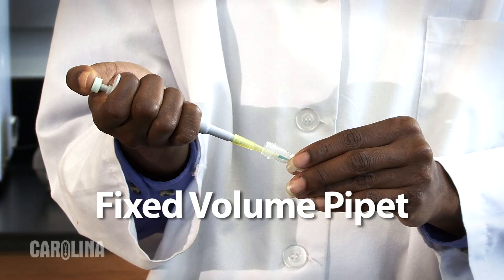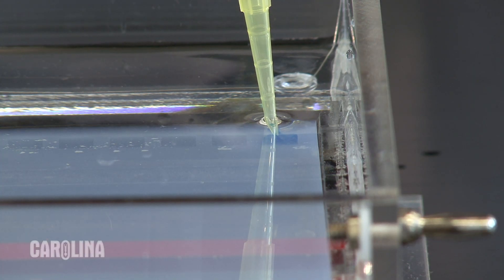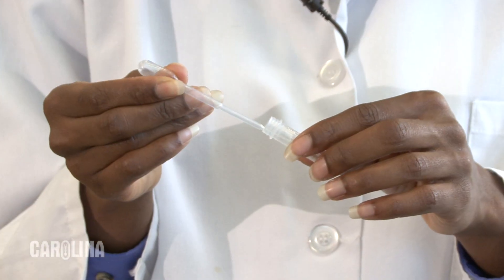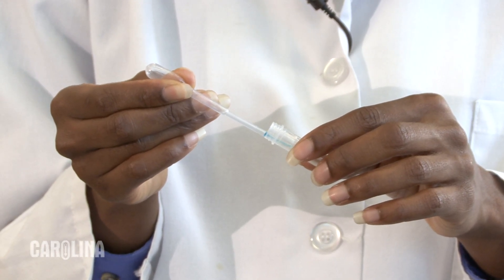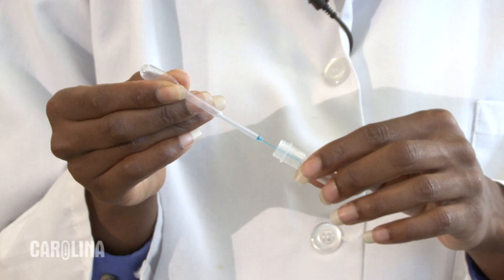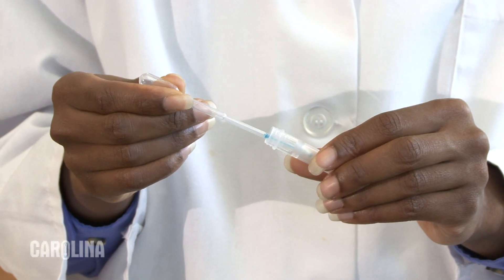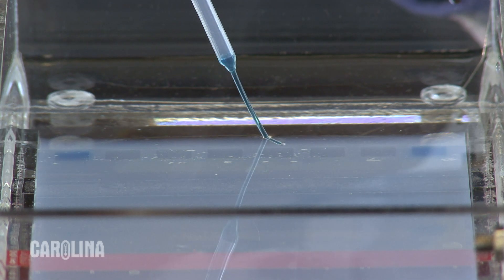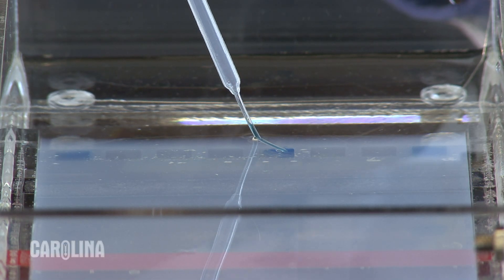Loading a gel using a fixed volume pipette is essentially the same as I've just shown. Be aware that some fixed volume pipettes have only one stop. If you are using a needle nose disposable pipette, gently squeeze the pipette at the conical shaped area just below the bulb. Place the tip of the pipette in the sample and draw the sample up into the pipette by slowly releasing your grip on the conical area. Don't stop squeezing the conical area entirely or your sample will get sucked up too far into the pipette. Gently squeeze the pipette until all the sample is loaded. Don't blow any air into the well once the sample has flowed out of the pipette.